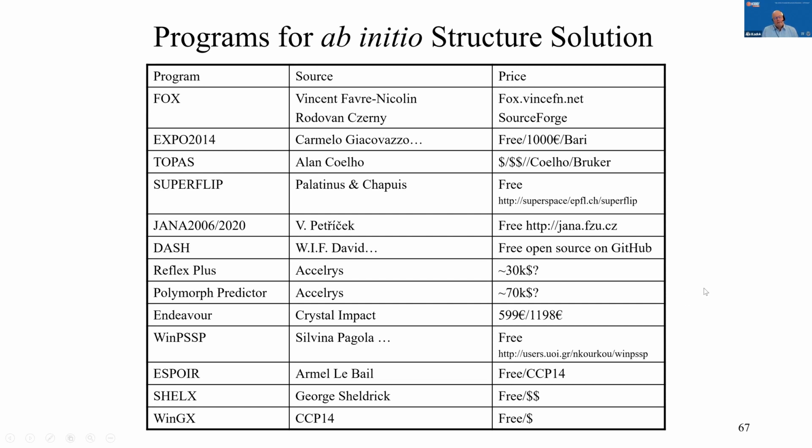It's worth having a variety of resources available because sometimes, just like with indexing, one program will work one time and not another. So you really want to have a variety of tools to apply to a particular problem. And as I've mentioned, even the direct method sometimes doesn't work one time and will work again. So you always want to try even the same program multiple times because you only need to succeed once.